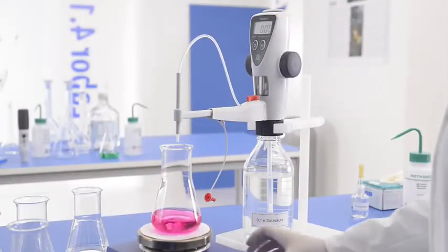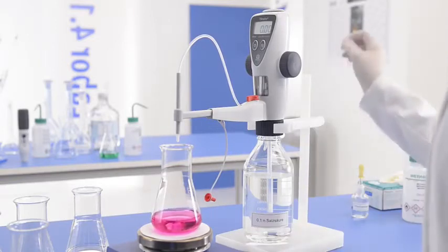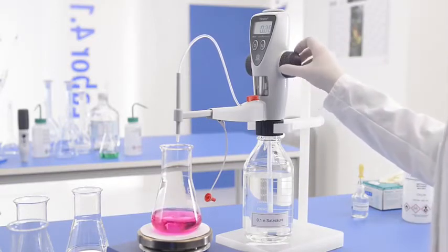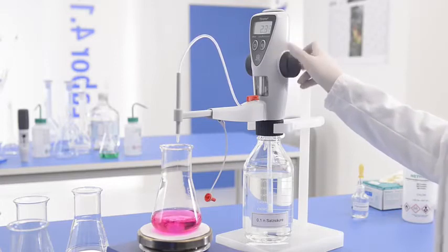If the titration is started without a full refill, as shown here, the piston may reach the stop before the end point.